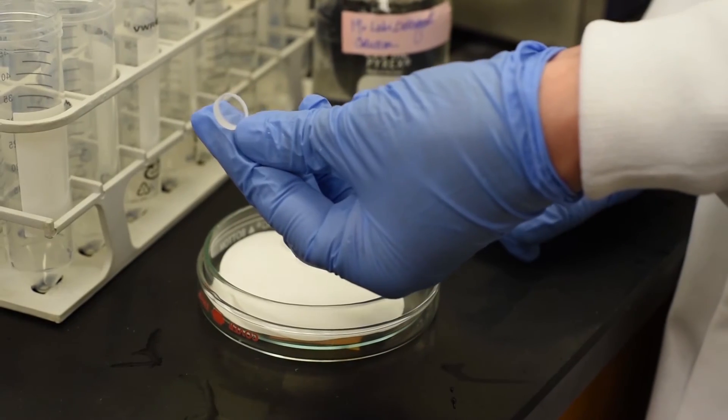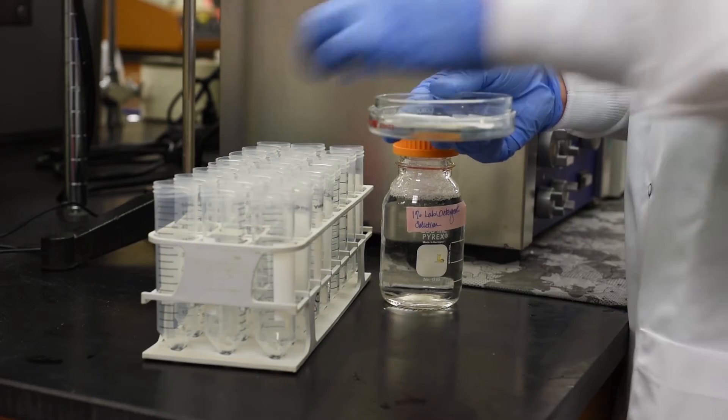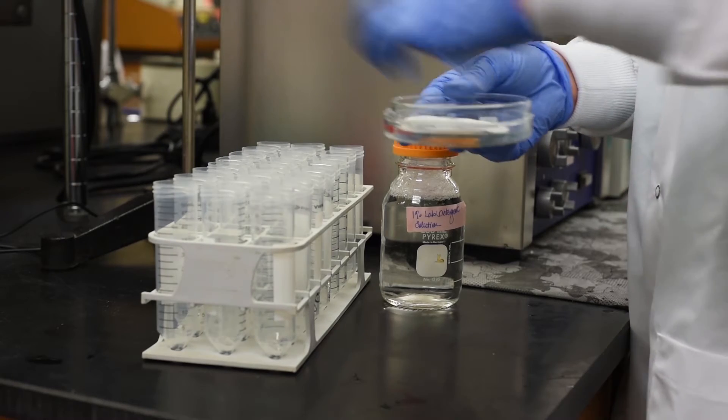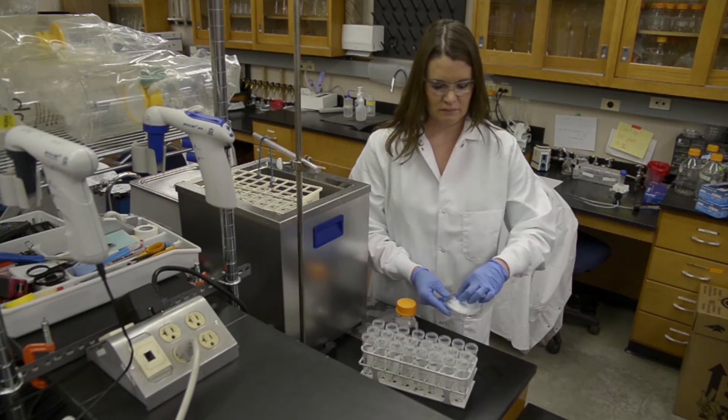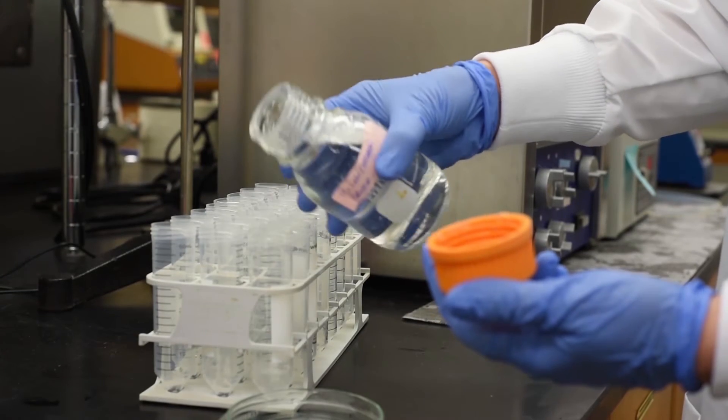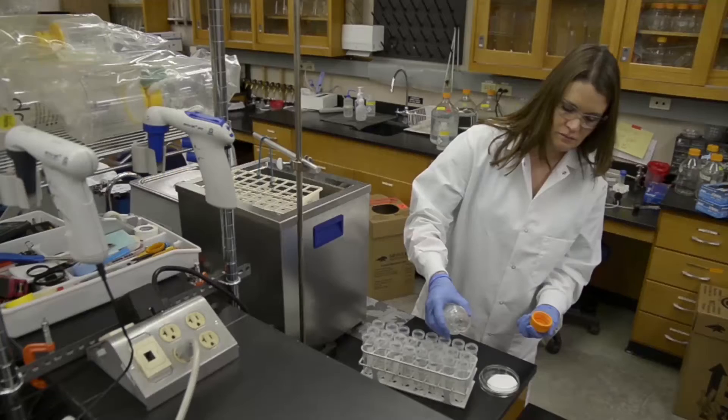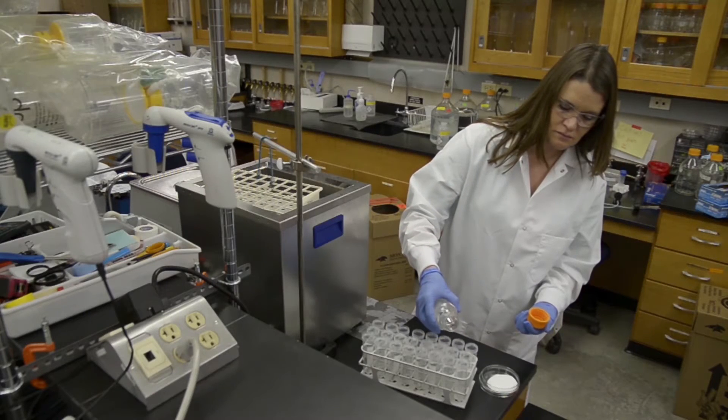For glass or other coupon materials that are easily scratched, place coupons in individual 50 milliliter conical vials. Pour 1% laboratory detergent solution into the vials so that the coupons are covered.